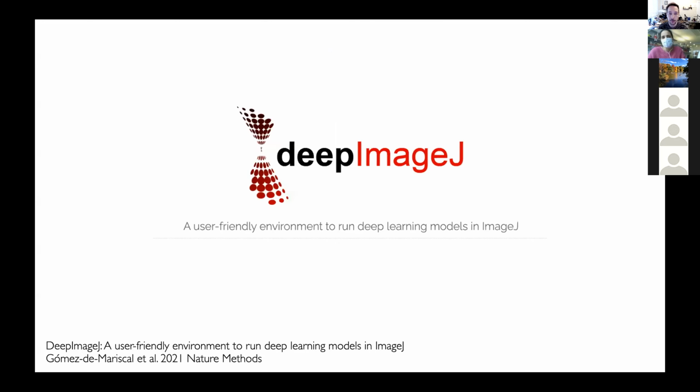And then importantly, this is what we're focusing on today for this practical: how to access these tools. For a while, there's been many of these papers coming out, but if you're a biologist, you can read the paper and you might be excited about using it, but then there's this big barrier of, okay, how do I implement this on my data? How am I going to train this network? You'd have to invest a bit of time in learning Python and getting comfortable with implementing these models. But that's not the case anymore. And there's been a lot of work in making these tools available to everyone.